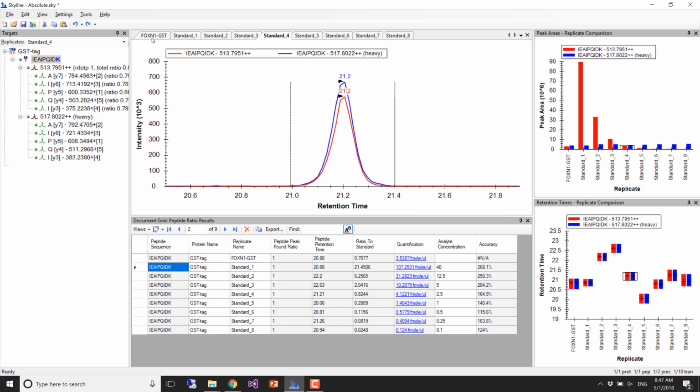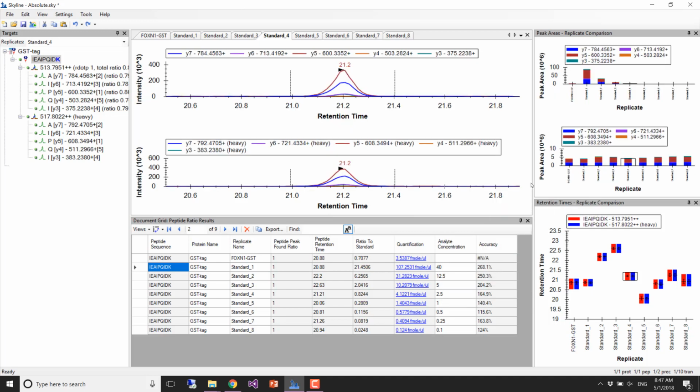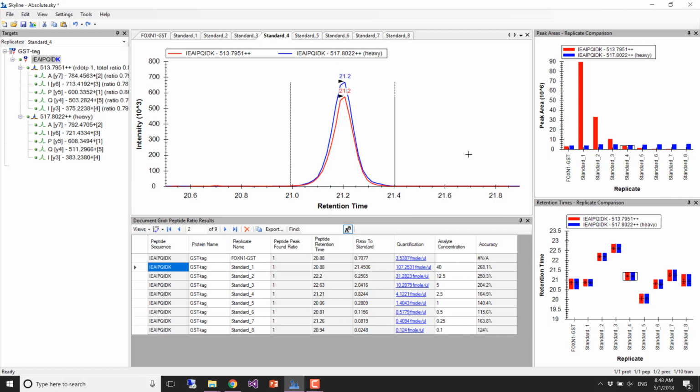Sorry, what? The same scale? Where don't you have that? Oh, you mean like transitions split in a graph like this? The third versus 10 to the 6th, like 500 10 to the third instead of 5 10 to the 5th or whatever. Let me just look. Oh, okay. Well, so you can.